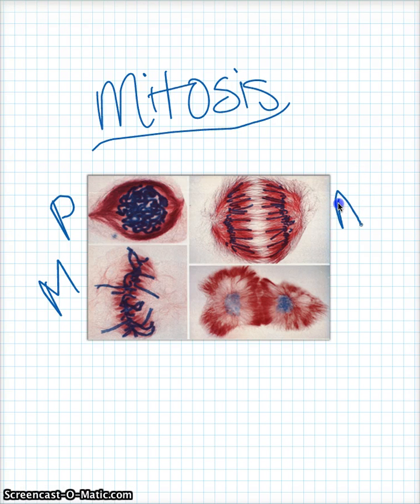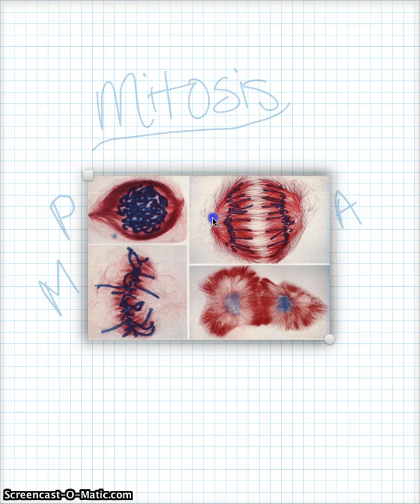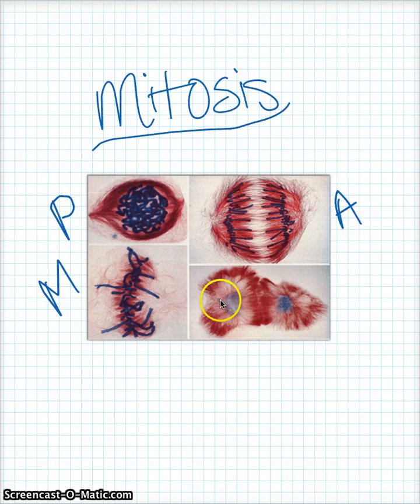And then, anaphase is this next one. You can tell it's anaphase, because the pink spindle fibers are separating, and the chromosomes, the purple, blue-colored chromosomes, are separating from the middle and traveling toward the opposite poles. Here's one pole over here, and one pole over here.